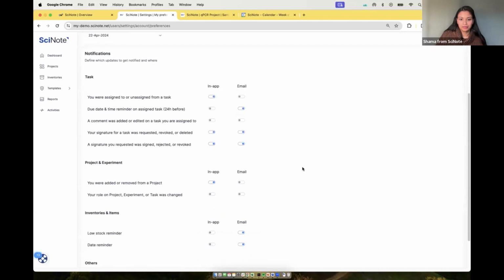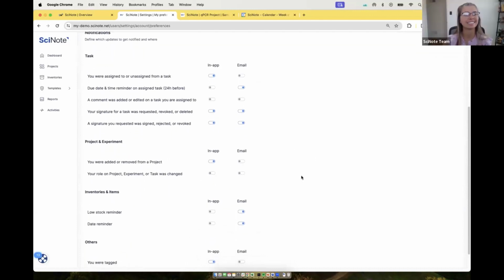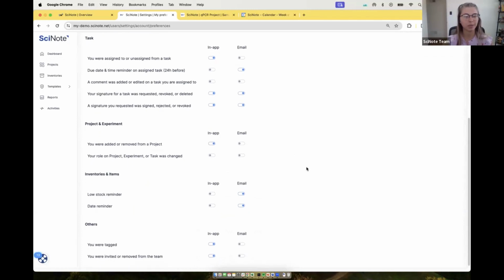Yes, but I was very excited when the notification revamp came out because the granularity in what you're receiving is, I'd say, strides ahead compared to what it was before. Definitely.